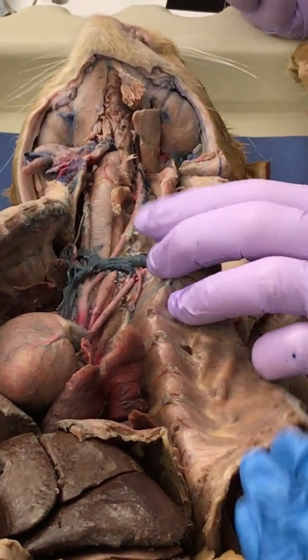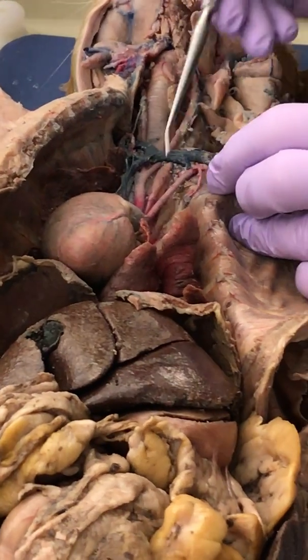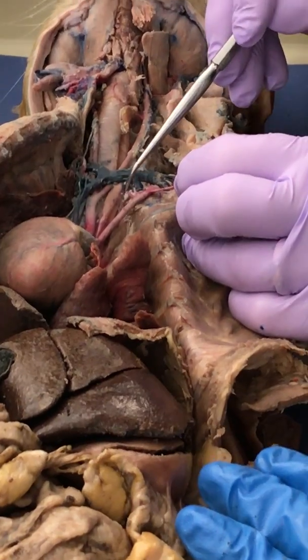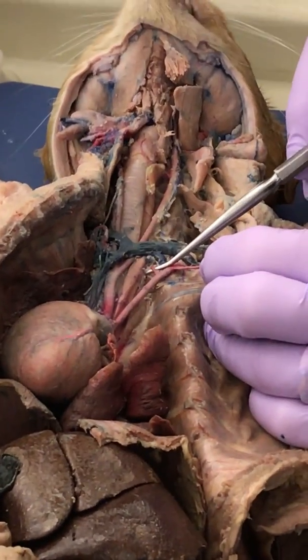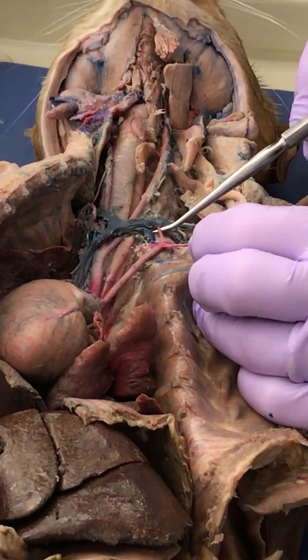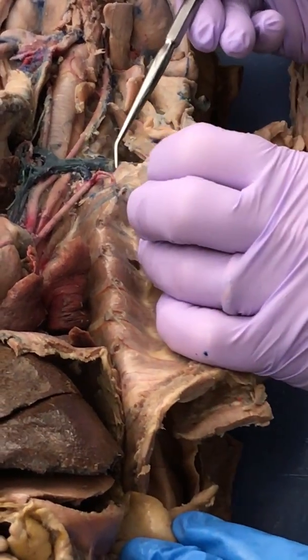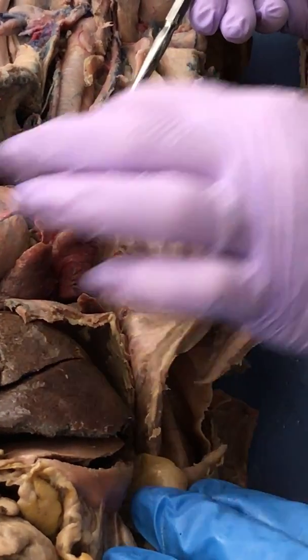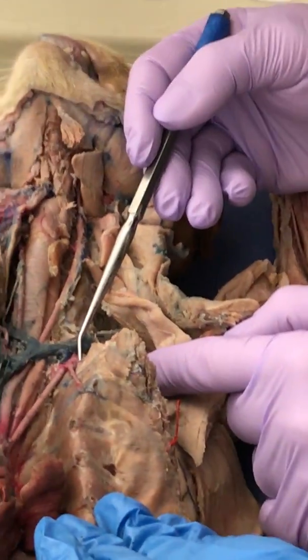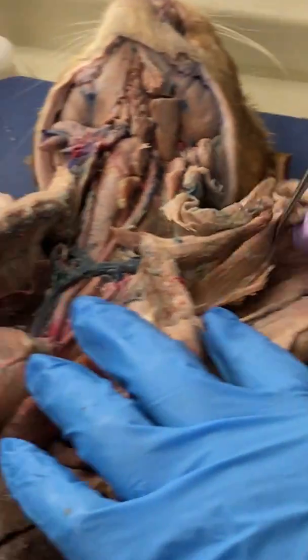A good thyroid gland. Okay, over here we have the left subclavian. And then this is your internal mammary, and I'm going to pull on it. And then we see your VCT, vertebral, costocervical, thyrocervical. And then pretty much as soon as you can see, I've got the rib cage here. So that really is the end of the subclavian and the beginning of the axillary. Because now I'm in my cat's armpit.